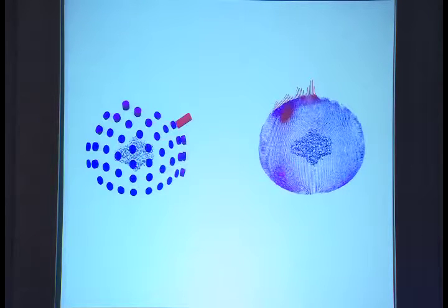So this is to show the orientation distribution. When you start, it's sampling coarsely, and you see a lot of red peaks, which means there's a preferred orientation of this molecule. Then as you go towards the end of the resolution, you see finer peaks here, and there is some preferred orientation, but it covers most of the molecule.